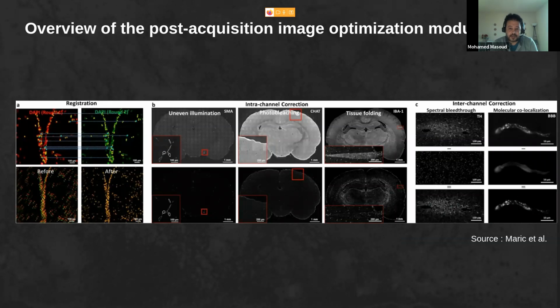The post-acquisition image optimization module starts in the beginning by doing a registration for the different channels. They use a mid-level image processing technique, which is Oriented FAST and Rotated BRIEF, abbreviated as ORB.